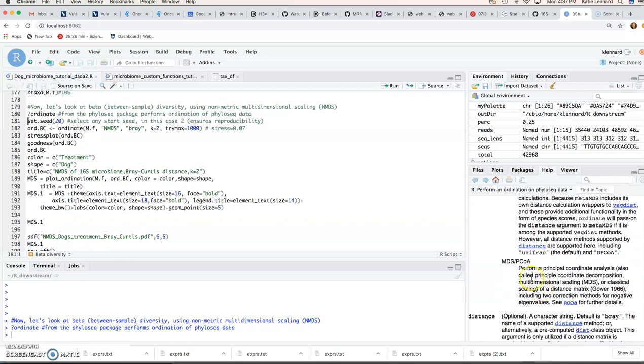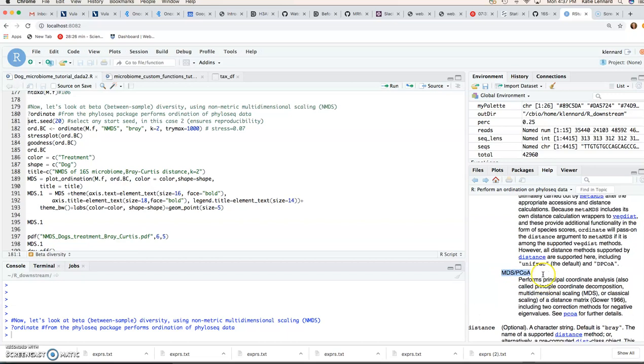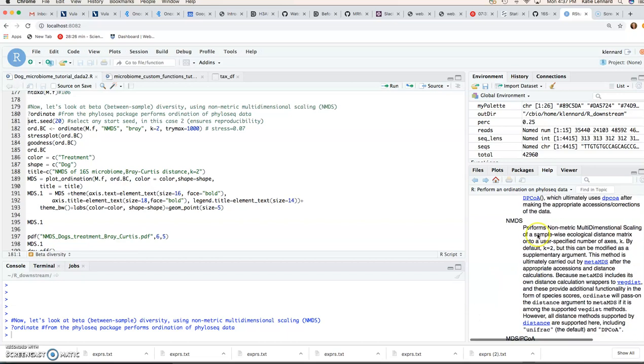If you scroll here, you'll see you can specify either, but it gives you the same result. But in this case, we're going to focus on the non-metric multidimensional scaling.